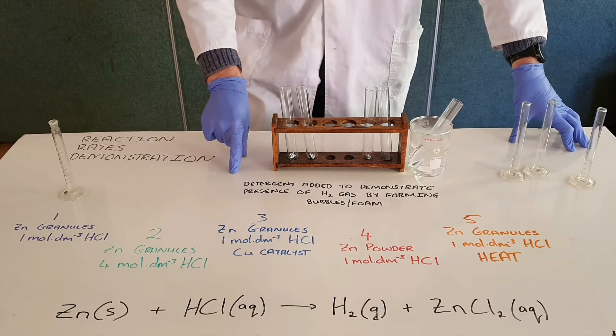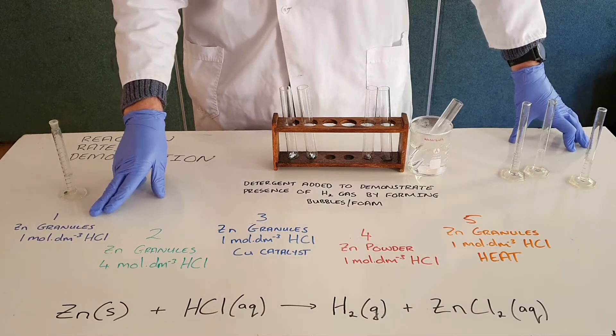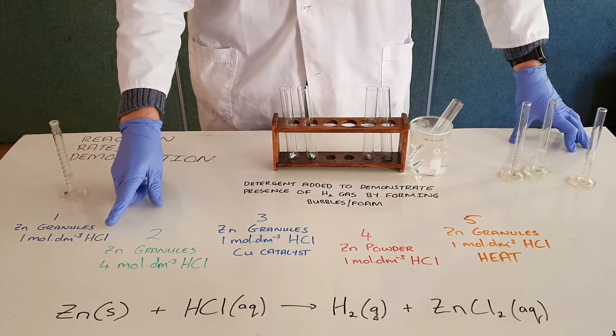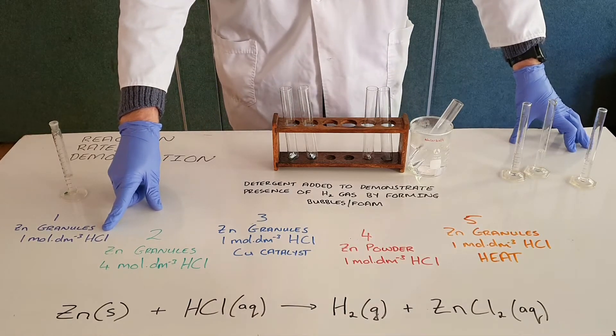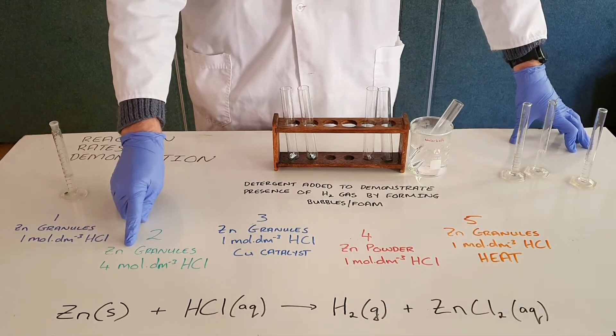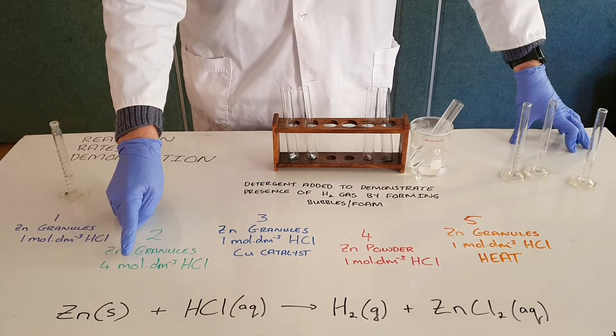In our first test tube we have zinc granules, also known as zinc chunks, with 1 molar hydrochloric acid. The second test tube has zinc granules with 4 molar hydrochloric acid. The third test tube has zinc granules with 1 molar hydrochloric acid with a copper catalyst.